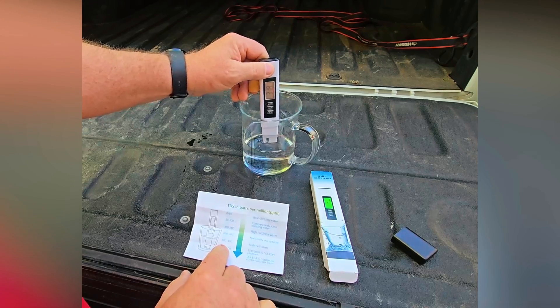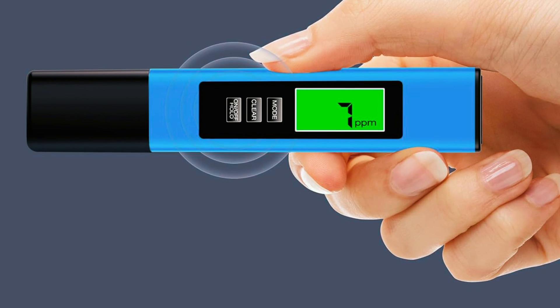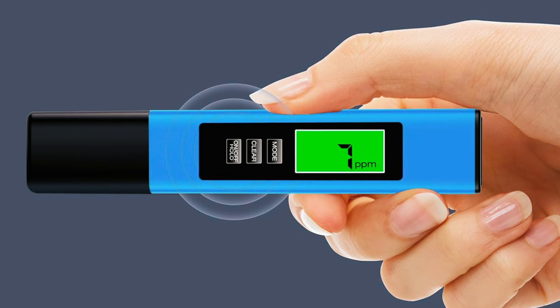It's a great option for users who want a full-featured water testing device without spending a fortune. Whether you're measuring the quality of your drinking water, checking reverse osmosis systems, or working with aquariums, this unit covers a lot of ground.